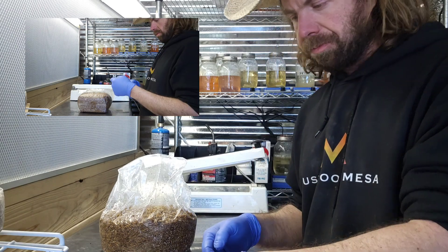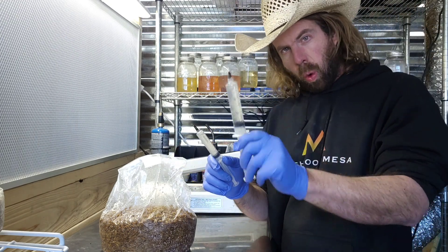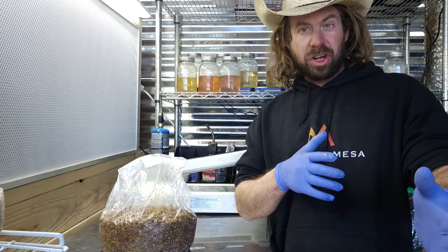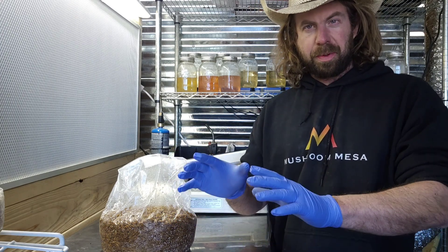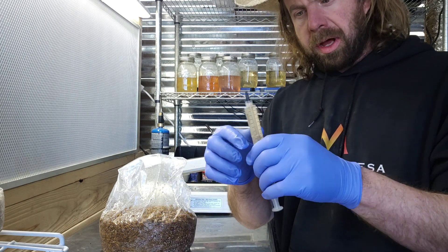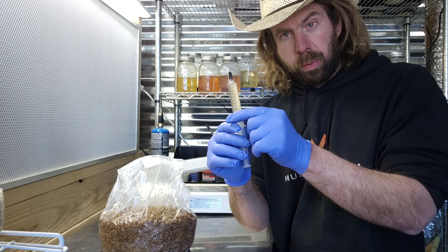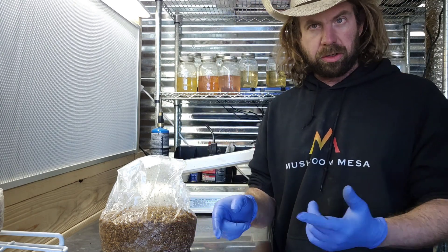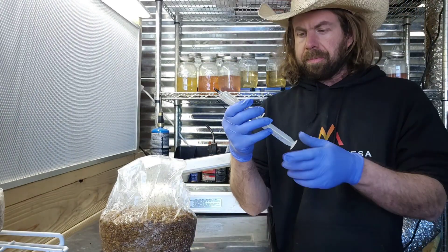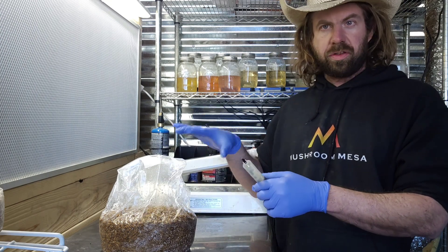I've got 12 different types of liquid culture here. I've got some 10cc syringes and also some 20cc syringes. It really doesn't matter ultimately what size syringe you're going to use. You want to use a minimum of five cc's per bag. So a 10cc syringe — you'd want to use at least half of it. These 20cc syringes can do four bags of grain.